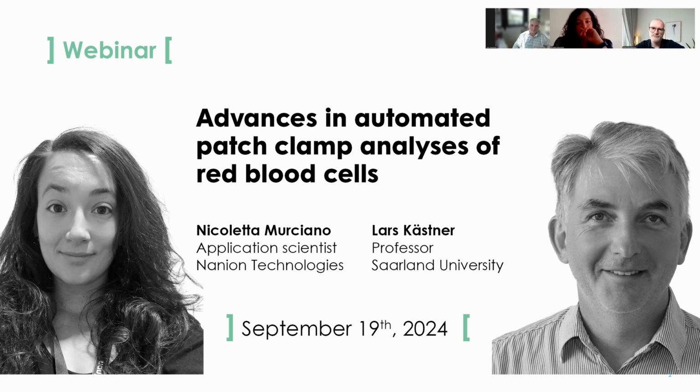All this we obviously don't have in the red blood cells. But if you think about whether you could also realize the same effects with a two-pool system in the red cells, just cytoplasm and external, it's possible, but it can't be so nicely synchronized.